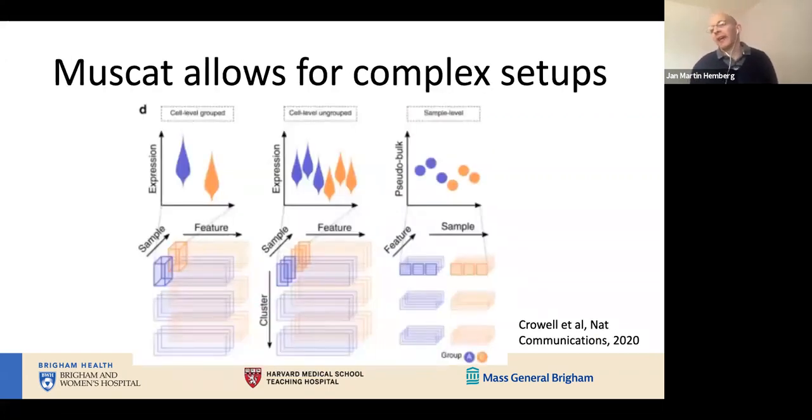One problem that you often have when you're trying to do this differential expression analysis is that you will end up with a lot of different comparisons, especially if you have multiple data sets from different conditions that each have been clustered. So you have multiple groups. Then you can end up with a very large number of pairwise comparisons, which is problematic cognitively for you to process, but also, perhaps more importantly, from a statistical point of view, you'll have a lot of multiple testing correction that can result in you losing power.